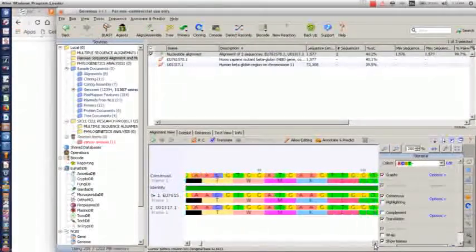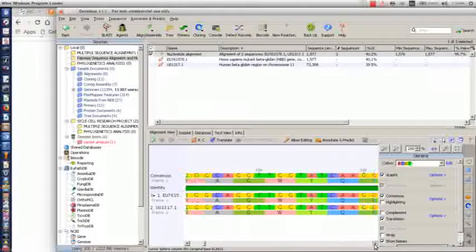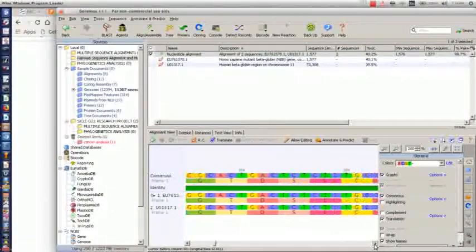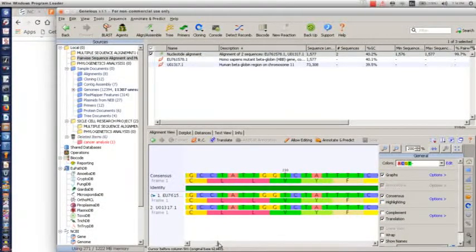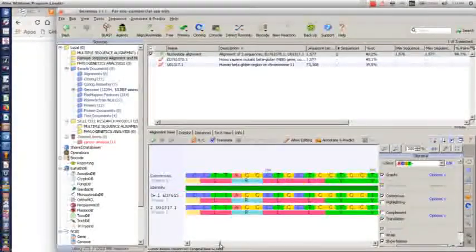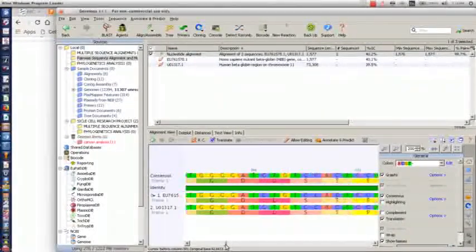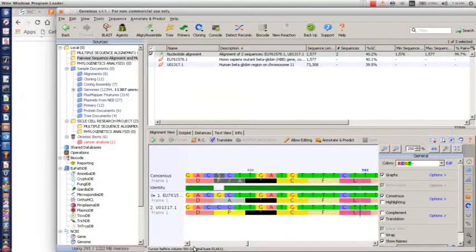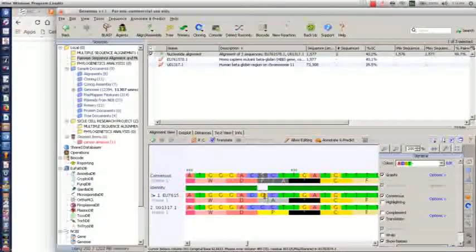You understand? So let's look at the other mutation that took place. Let's just take it because of our time. So we have it here, and as you can see, we have CGC. Are you getting it now? We have CCC.